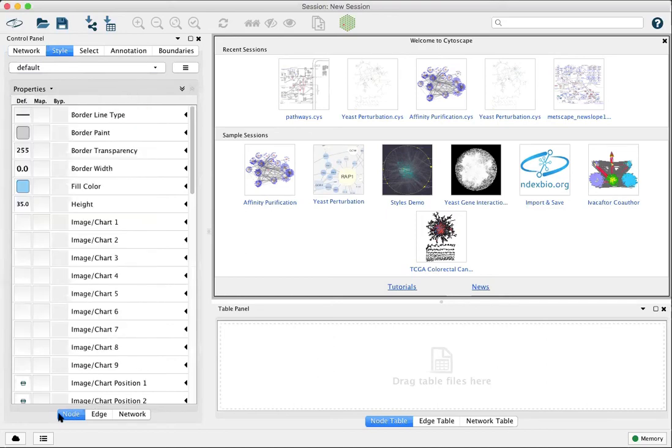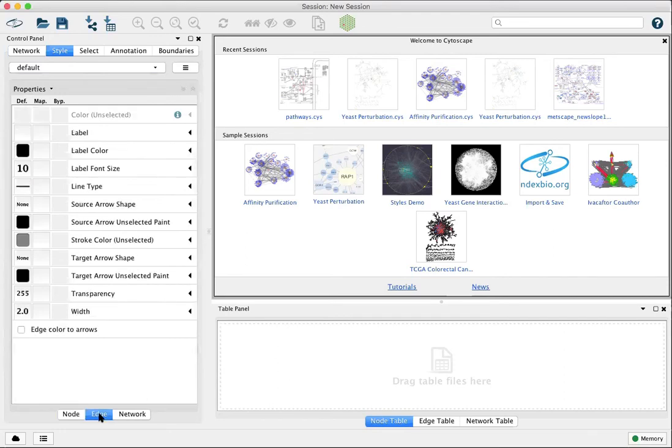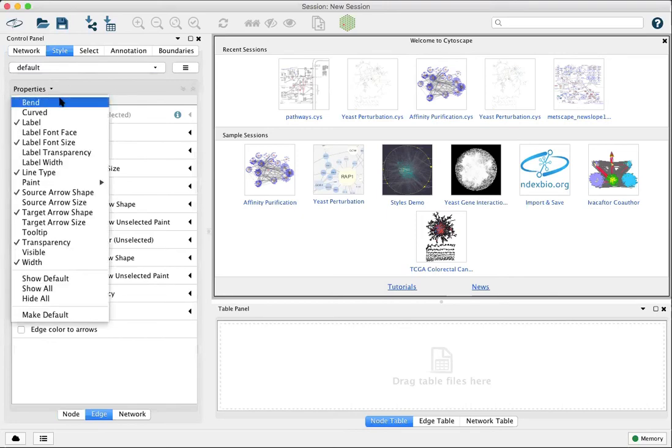In addition to the node properties, the same thing is the case for the edge properties. Go to the edge tab within styles and under properties you can see there's some hidden properties.